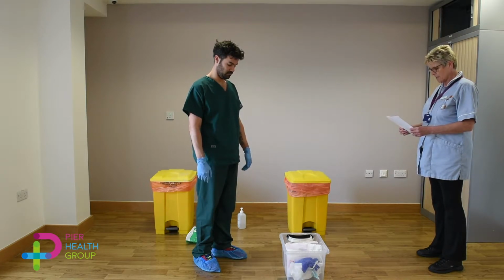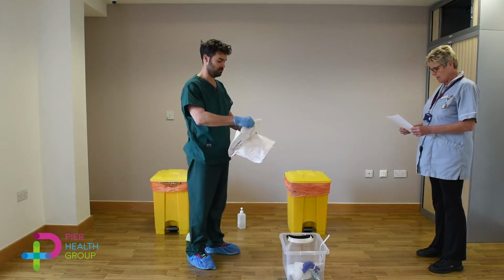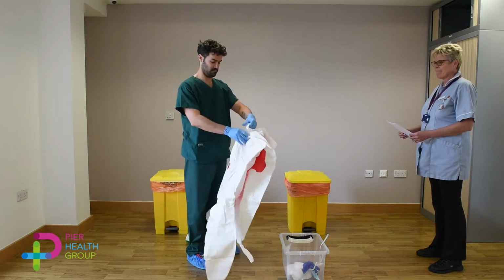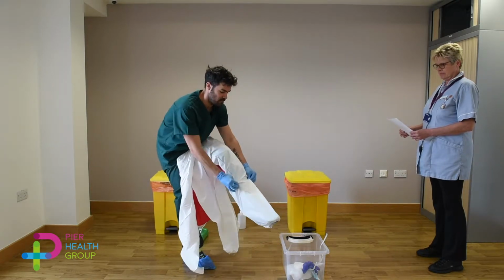Step 2 to dresser 1. Put on surgical gown and tie to the side. Pay attention to the collar and cuffs. If wearing a suit, step into the suit and zip up fully. Pay attention to the collar and cuff.